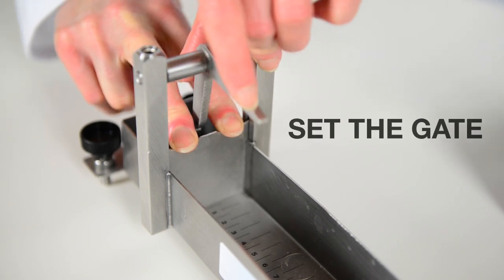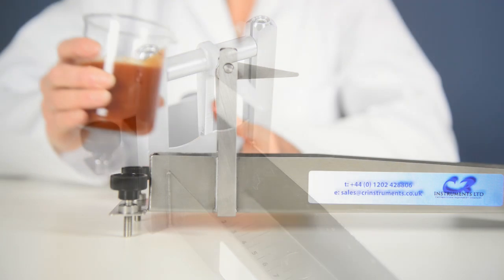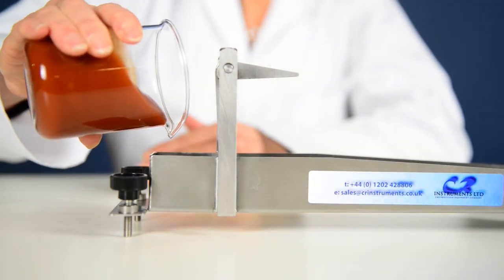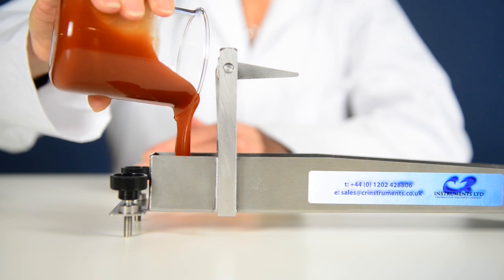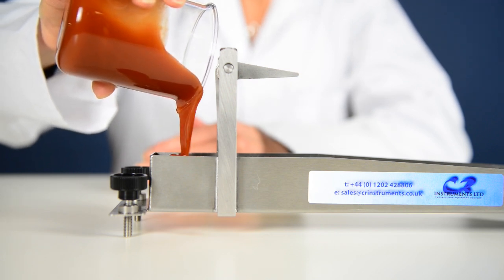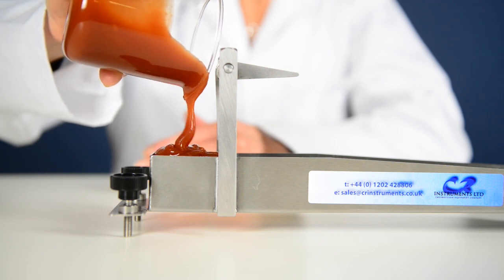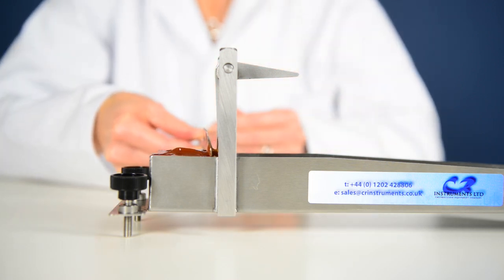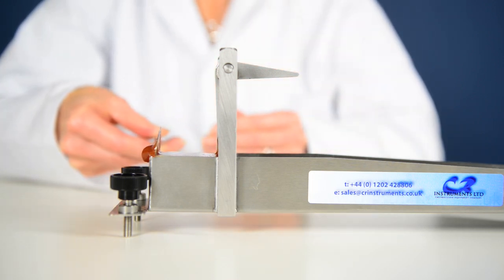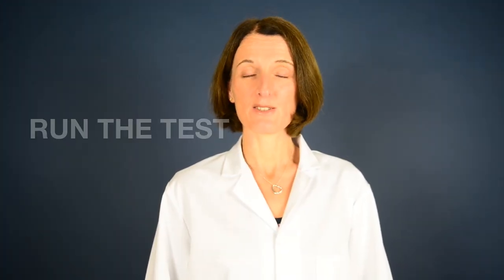Make sure the gate is down and locked. Pour the sample into the reservoir. I'm now ready to run the test with my 75ml sample.